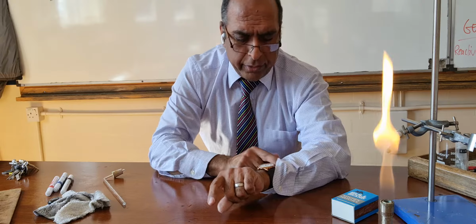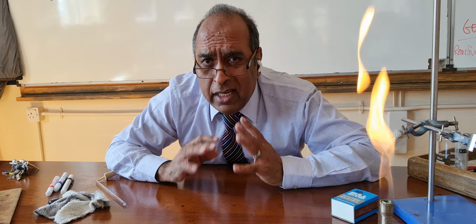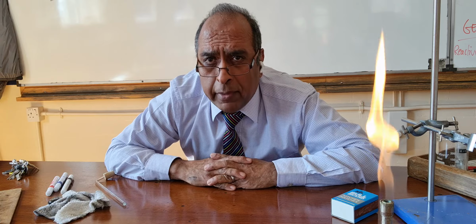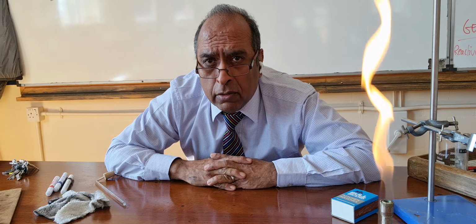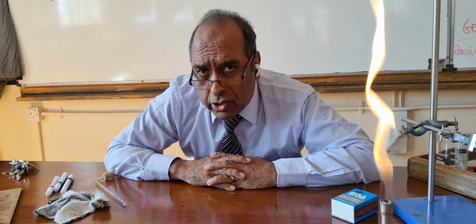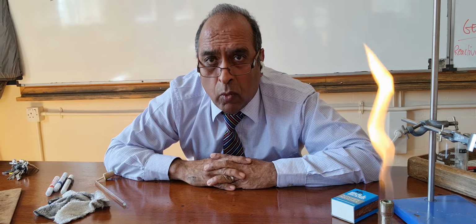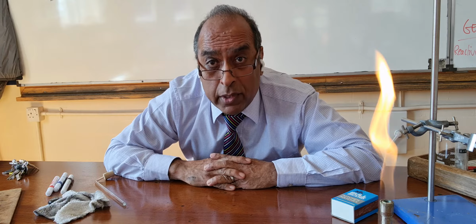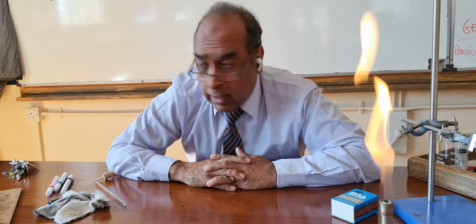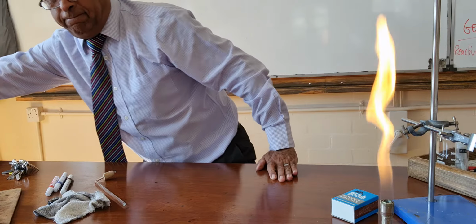So the reaction with cold water is very slow. Do you think it'll be any different if we use hot water? And not just hot water, but the hottest type of water we can get. What about steam? What if we try and react magnesium with steam? Well, then the reaction becomes a fast one. And the apparatus we need to react it is this one.